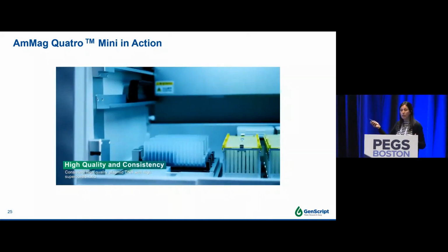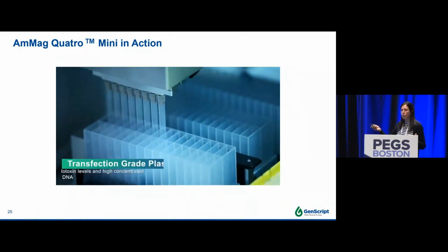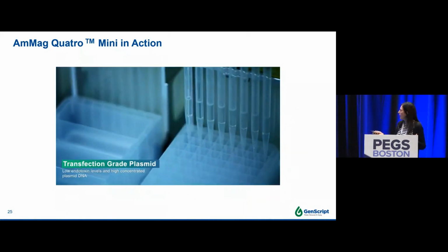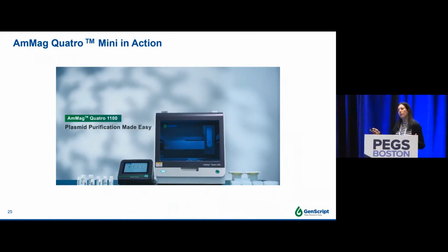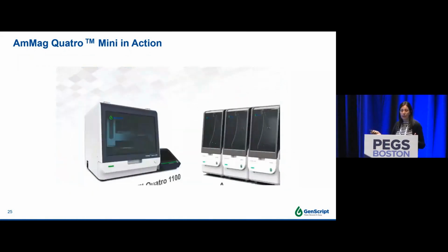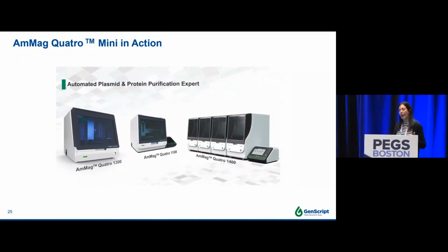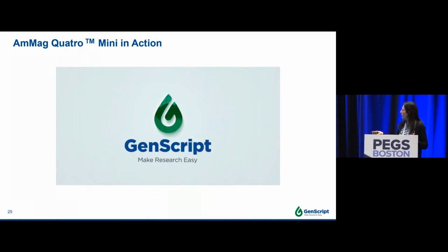The beads that are on the back of the instrument, in the reservoir, mix as well, so the beads are not going to settle down over time. And the plate where you're going to have your purified plasmid DNA is going to be a 96 well plate, and you are going to have half of the plate filled with purified plasmid DNA.